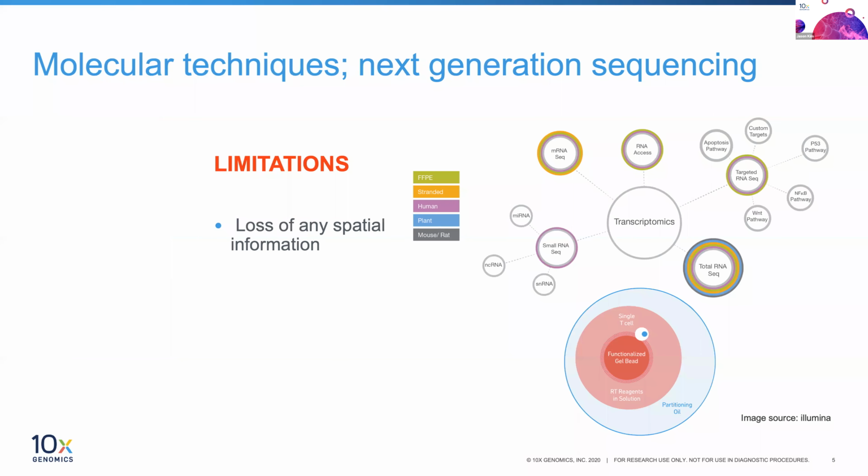in nature. And then on the flip side of things, there's a whole host of molecular techniques. And more specifically here, I'm referring to next generation sequencing. It's probably an understatement to say it's been revolutionary since its general adoption a little over a decade ago or so. And with NGS, you essentially get everything data-wise. It's just supercharged discovery: whole genome, whole transcriptome, whole exome, total RNA-seq, epigenome, you name it. It's been or is being done.